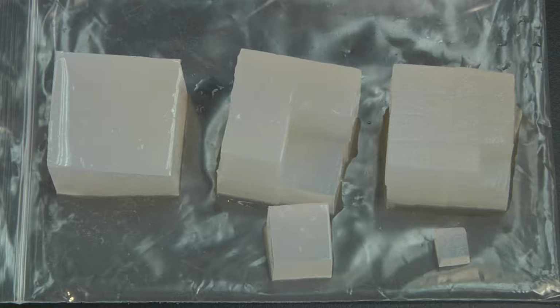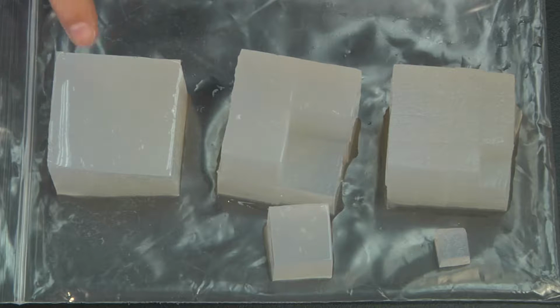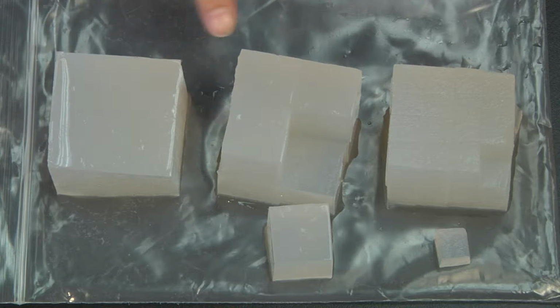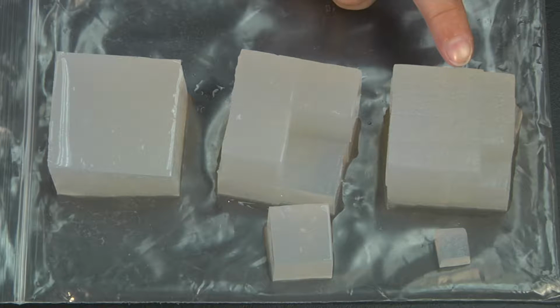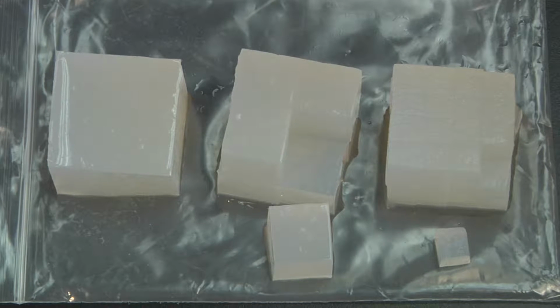I will now go ahead and introduce the materials needed for this experiment. First is agar cubes as model cells of the test. You will need 3 of them with 10% sodium chloride in it. This is the whole agar cube that will represent the largest cell. This is the agar cube divided into 8 pieces. And this is the agar cube divided into 64 pieces. Identical model cells with 10% salt solutions in them.